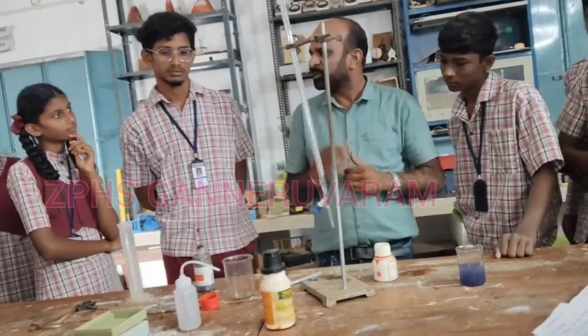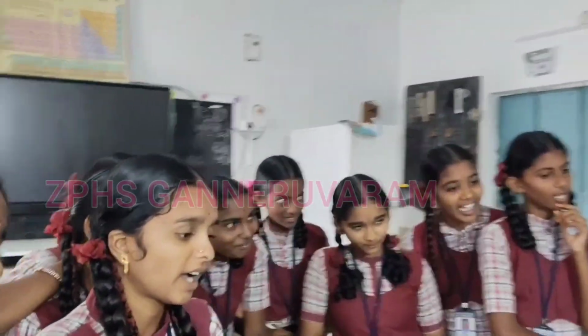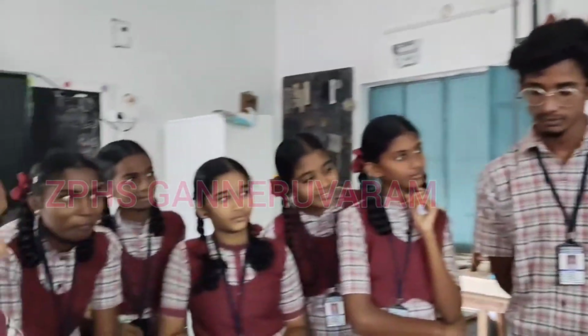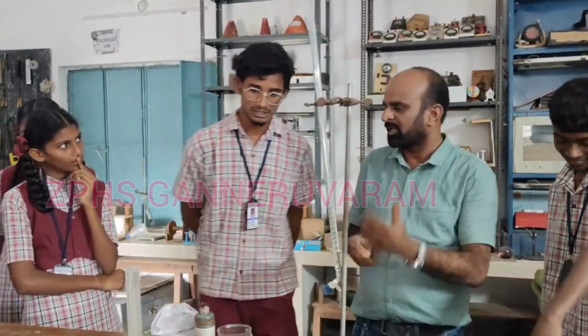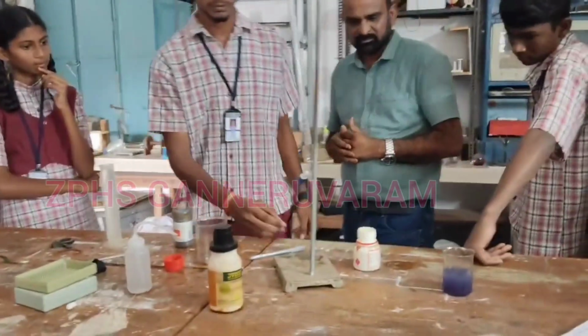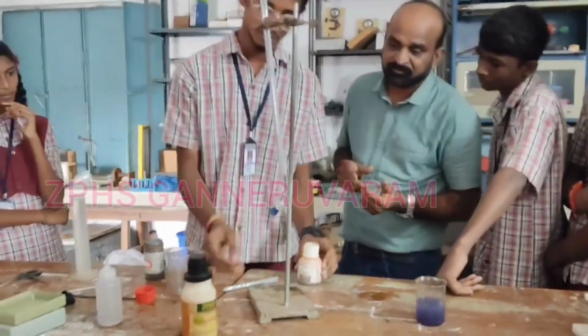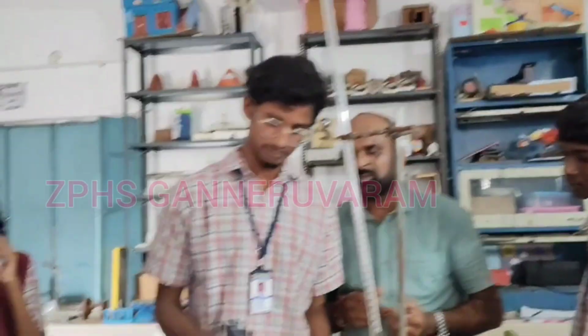Yes. Okay, what chemicals are used in this experiment, tell me. Sodium hydroxide solution, hydrochloric acid solution. Tell me, Vaishnavi, what's the name of the experiment? Neutralization reaction. What chemicals did we take? Sodium hydroxide, hydrochloric acid. Where is sodium hydroxide? Show me. Okay, this is sodium hydroxide. Where is HCl? HCl means hydrochloric acid.